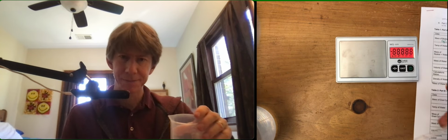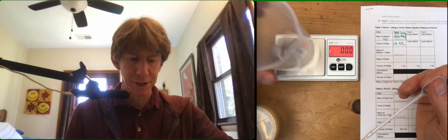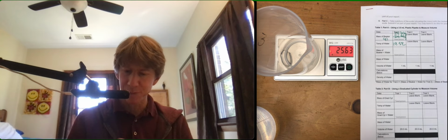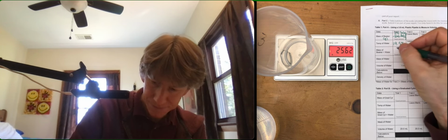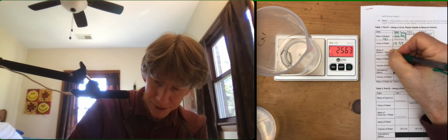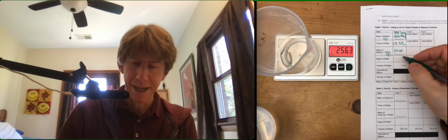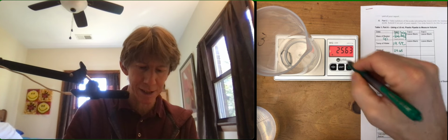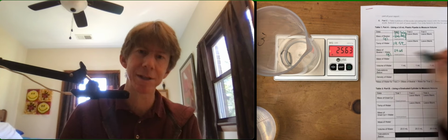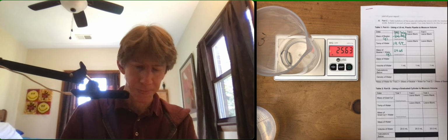Turn it on first. Put it on your scale. And I get 25.63. And these are going to be grams as well. And you'll notice we're going to do some more trials. And you need a picture of this, so please take a picture of your scale with the water, with the beaker, and showing the measurements for your lab report.